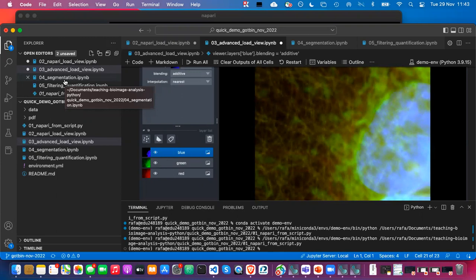So there are different possibilities. What we tend to do a lot at the facility is that we have an image analysis server. It's a Windows server, and in there is where we put the heavy calculations. That also gives me a lot of control. There was a question in the chat about the environments. What I do is create an environment that I know works on my server, so I don't have to share the environment with you anymore. I just share the user access to the machine. I give you the username and password, we install everything together in a Zoom call or something like that, and we know it works. Then you are running it and I have complete control because it's my machine.